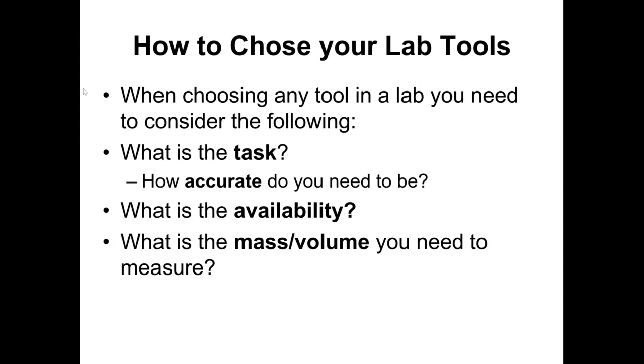You want to transfer a little bit, a little aliquot, as we say, into another container, and then from there you'll take the reagent that you need for your experiment. So if anything goes wrong, you do not contaminate the original bottle. So in that case, when you transfer it, you might not need to get the perfect volume. You might not require that. So you might use a different type of glassware that doesn't imply a super high accuracy.